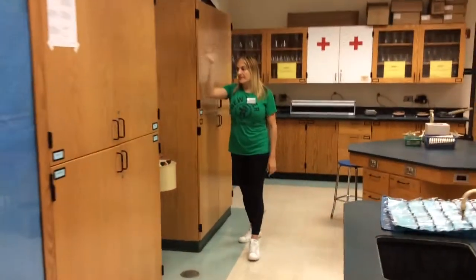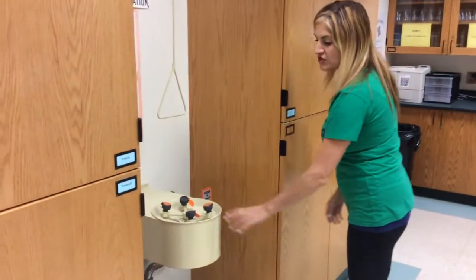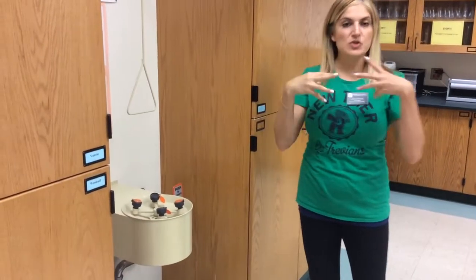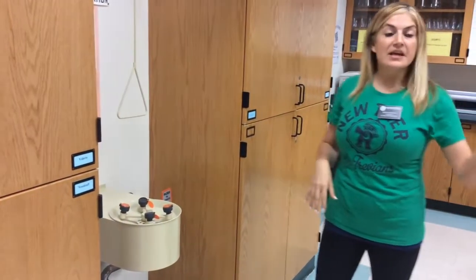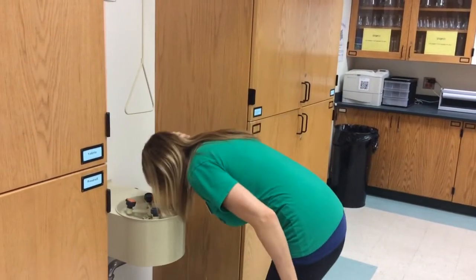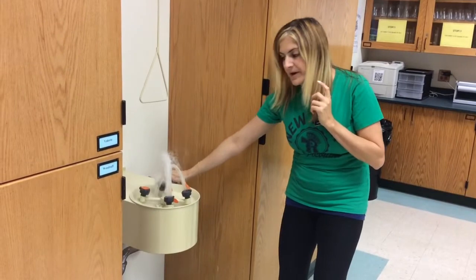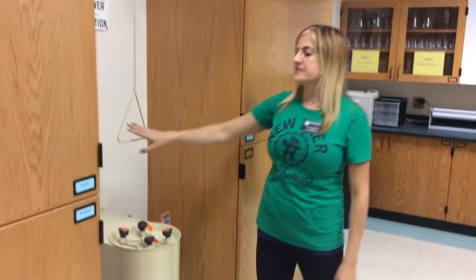I'm going to talk about the Eyewash station. So this is the Eyewash station. We wear goggles at all times, but sometimes accidents happen and you might actually have something splash into your eye. You don't want to waste time. Have your partner hold you by the hand, lead you over here, put your face into the Eyewash station, and push this lever to operate. Okay? The shower is right here. This is called the safety shower.